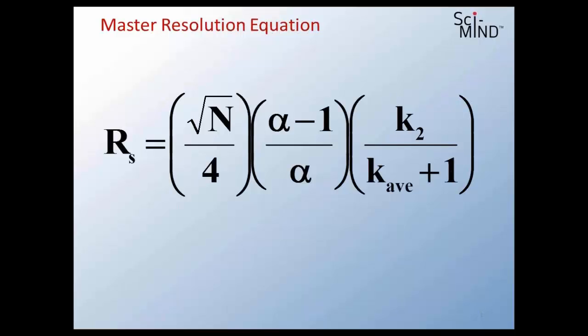Let's think about the master resolution equation for a moment. And this is an equation, do not ever use this equation to actually calculate a resolution, at least we don't. But what you can use this for is to help us think about all of the factors that contribute to resolution. Probably the main one is, you've got three of them here.